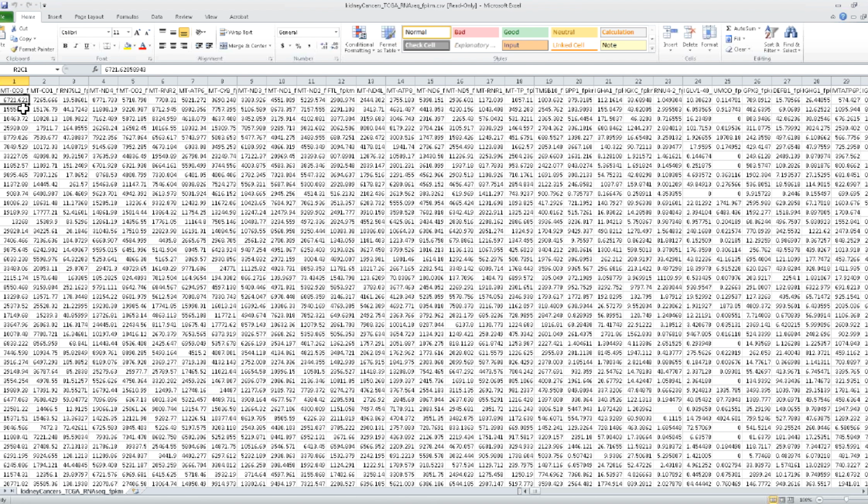So in this case, I would select this cell in their interface, and I can show you that in just a second. You'd select this cell, and that would mean that the first row is the annotation or the channel names, and this is the first column. So this is the first channel we're dealing with.